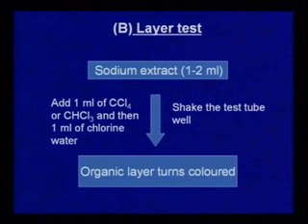Now sodium extract, you know, it is an aqueous medium. Yes, and you are adding chloroform and carbon tetrachloride into it. What are those? They are organic solvents. So you will get 2 different layers. Okay, so the 2 different layers are obtained. Now the aqueous layer will be colorless and you will get the color in the organic layer.